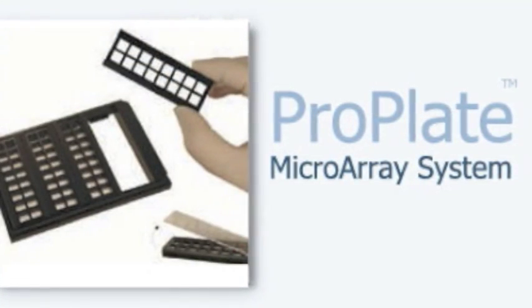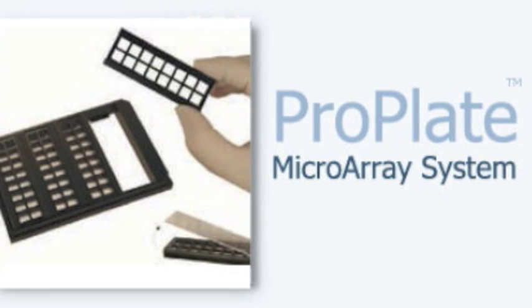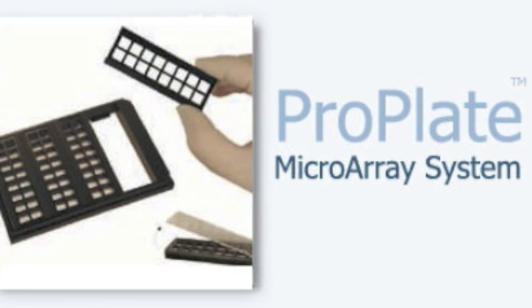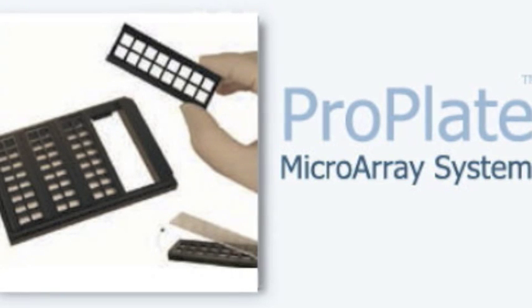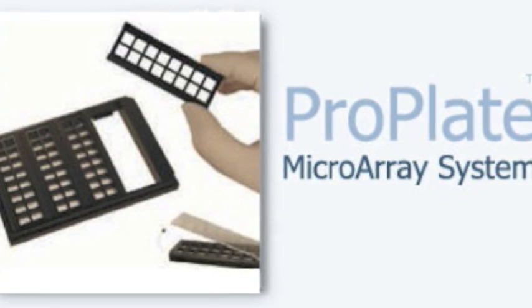The ProPlate microarray system from Grace BioLabs provides efficient and consistent results by enabling active mixing during hybridization. It also integrates the use of microarray slides into high-throughput robotic processing and handling.